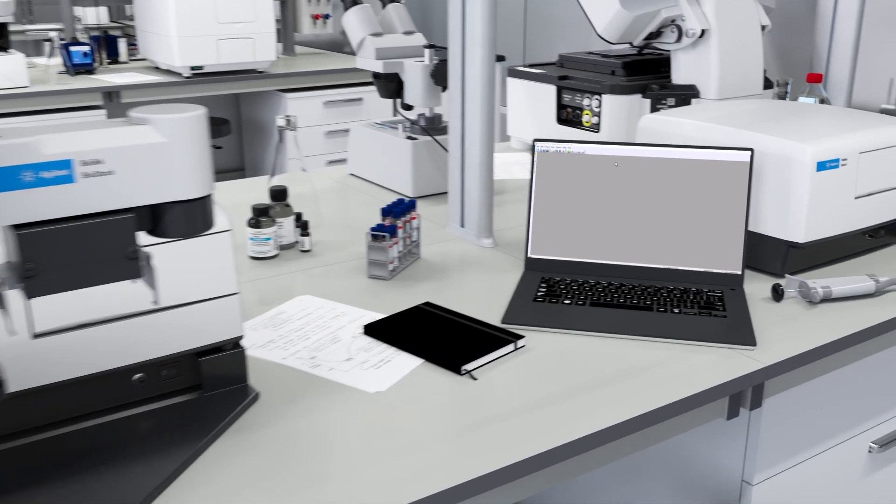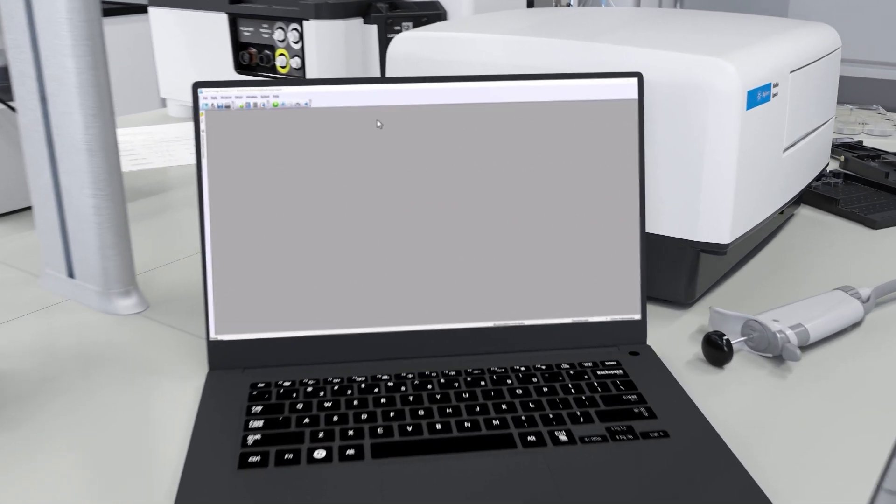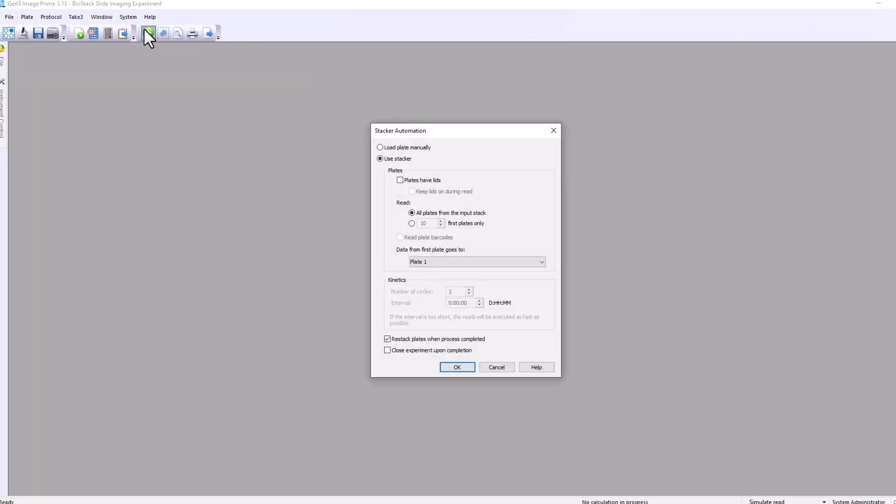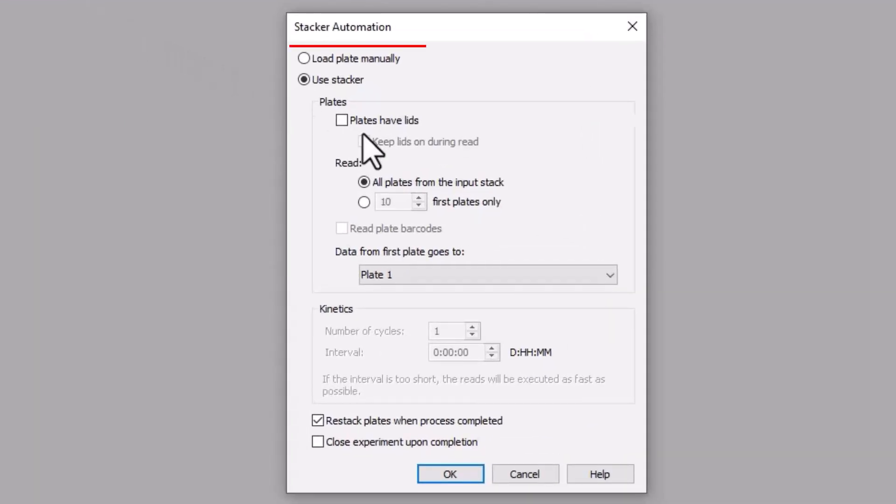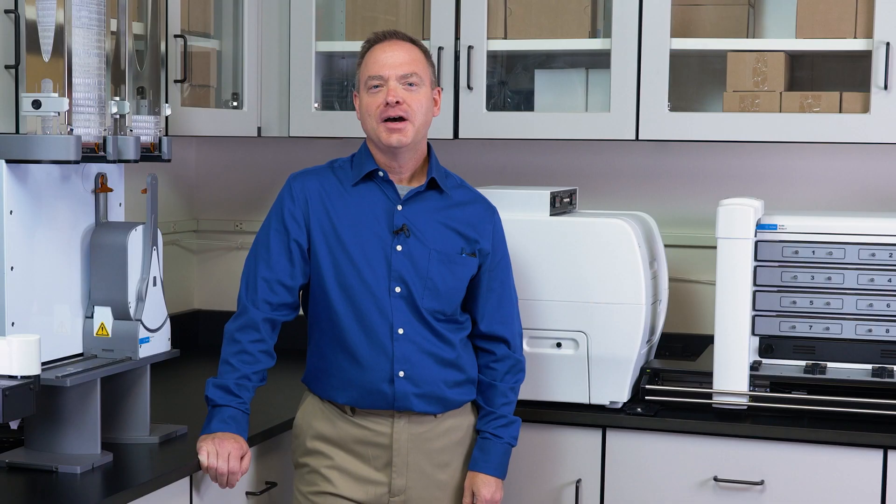The BioStack is easily controlled by the Gen5 software. At the beginning of a run, the user has the choice of loading plates automatically or by hand.